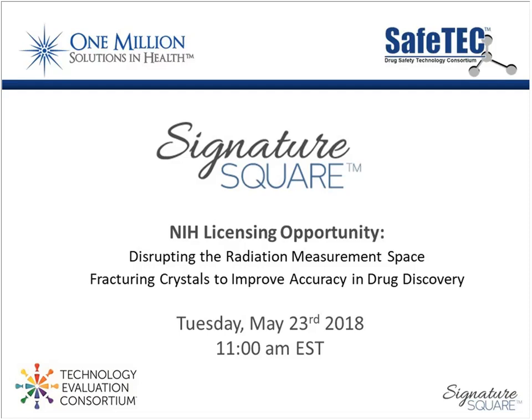The current research into this new technology will be presented by Dr. Adler, who I'll introduce in a moment, who has built a fully operational 8-crystal segment microdose calibrator to test his invention. The results of his work will show the potential for the technology to improve accuracy and efficiency of the work done at the preclinical phase of radiopharmaceutical drug discovery. So quite phenomenal.